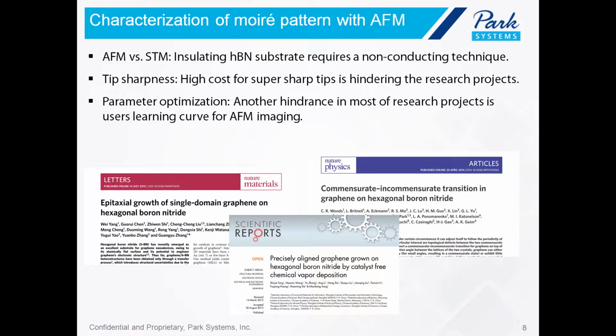So that's why we definitely wanted to use non-contact mode AFM in this case, just to mitigate the tip wear and to preserve the tip sharpness, to show that the characterization of the features on the superlattice pattern could be done repeatably, and again, without advanced tip wear. And we also wanted to keep resolution as well.